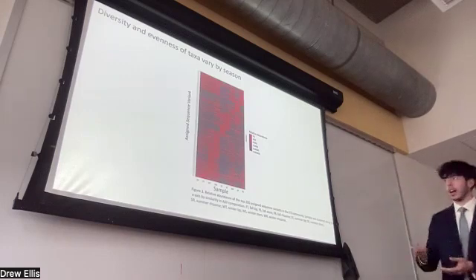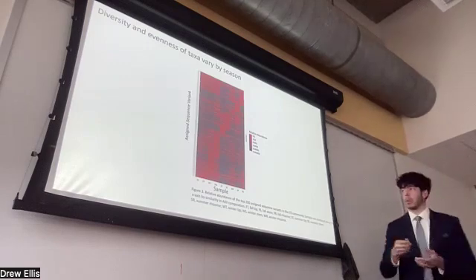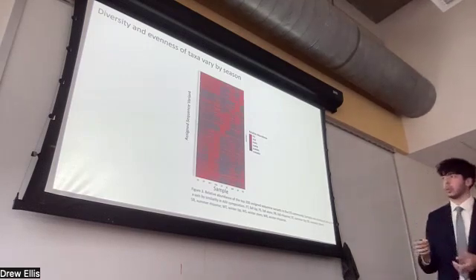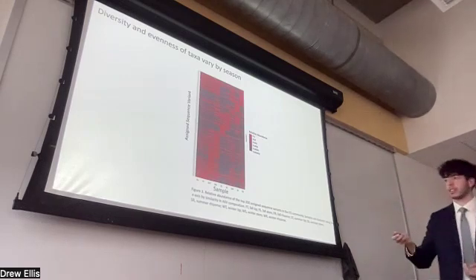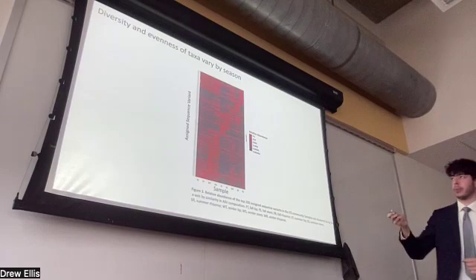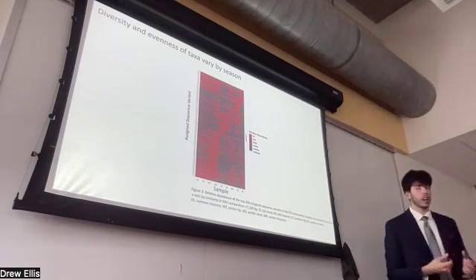Okay, and where you're seeing red is represented at higher abundances, and where you're seeing this black-blue, it's represented at lower abundances. So if you look at fall specifically, you're seeing more blue than red. Of course, you're seeing some red. That's a given. It's going to have some species in there, obviously.